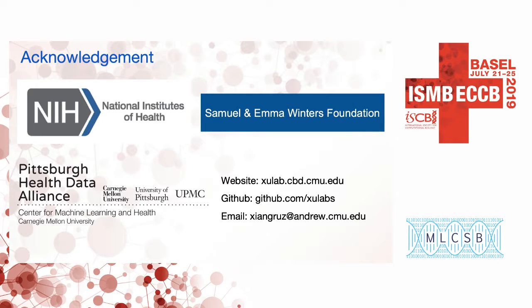Please go ahead. I was wondering, how does it handle rotations of the data if the structures are rotated? Is it still invariant to that? That's a very good question. For domain adaptation, we do not take rotation into consideration because there's no evidence showing a rotational preference difference between the source data site and the target data site. But in terms of subtomogram classification, since the macromolecule structure is randomly rotated inside the subtomogram, if the training data set has a diverse rotation for each structure, the testing data set will be fine. It can correctly predict the same structure even if they're in different orientations, and also for small translation.